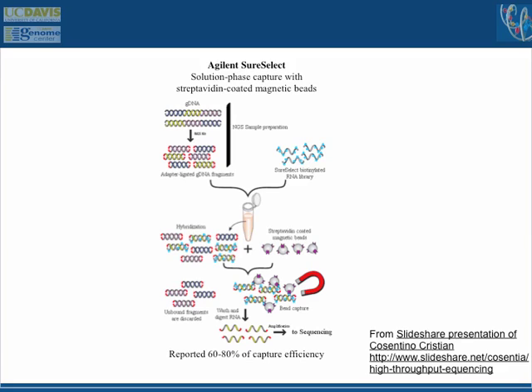There's a company that Agilent just bought that has some technology that allows you to capture 100,000 base pair pieces and retain the haplotype structure when you're making the library. In essence, you shred up 100,000 base pair pieces into a sub-library and then do the sequencing off of that, so that if you care about haplotype structure, you can recover it.